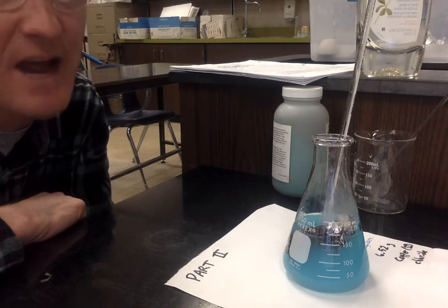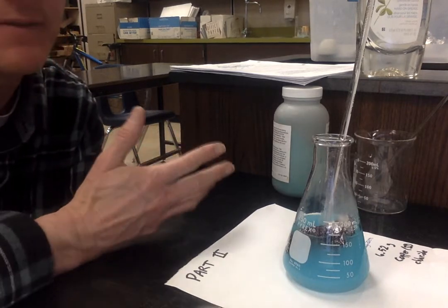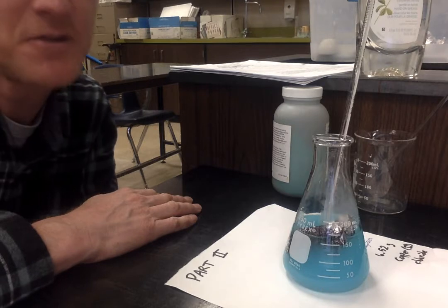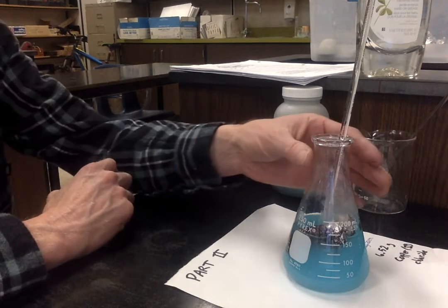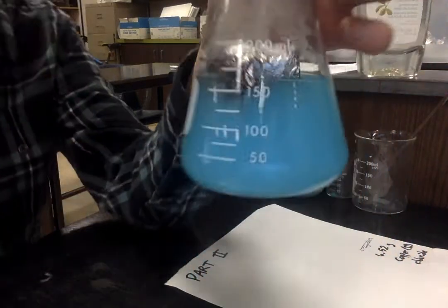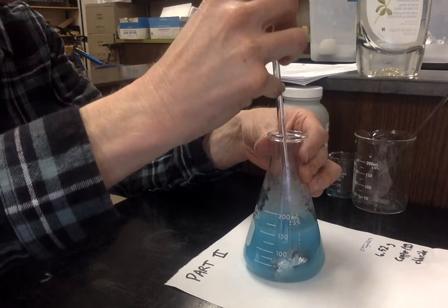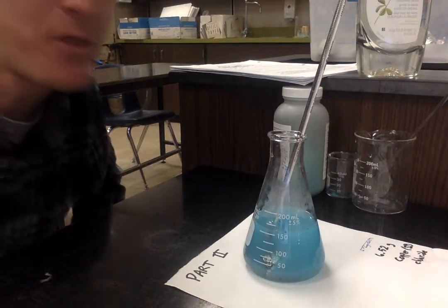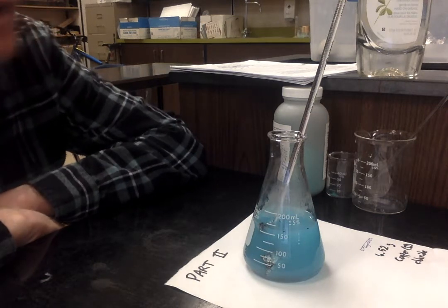If you think there might be a reaction happening, look for a color change, look for release of a gas. You don't always see these things. They don't always happen. A temperature change is even stronger evidence that some kind of chemical reaction is happening. Let's look again up close at this. Copper chloride and aluminum, brown, floating foil. If you're in Chemistry 11 and you're watching this as a makeup lab, you should be thinking about what the balanced chemical equation is for this chemical reaction, because you learned that in Science 10.